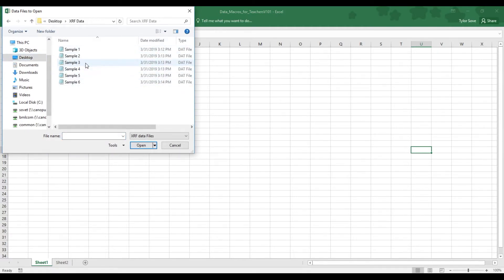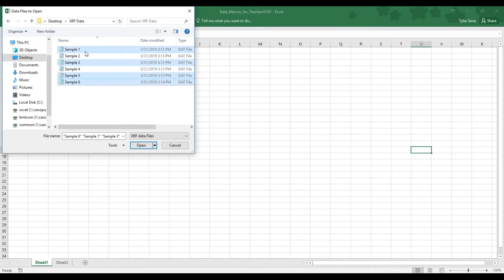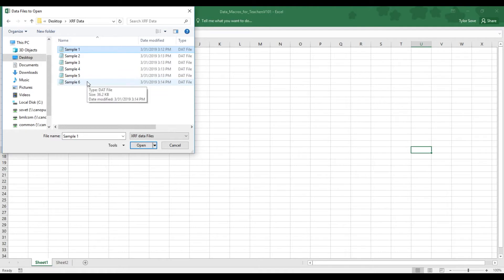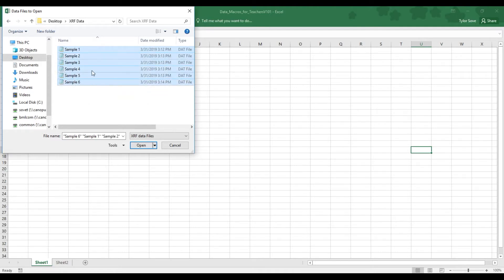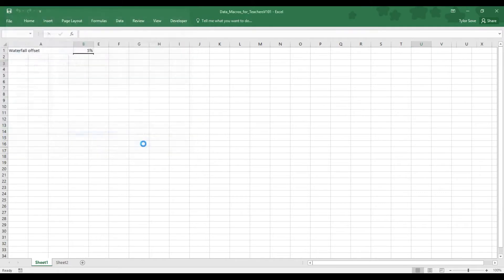Once you have your data at hand, you can hold Ctrl and select individual files, or if you select the first one and hold Shift while selecting the last one, you will select every file in between. Now from here, you can open up your data.